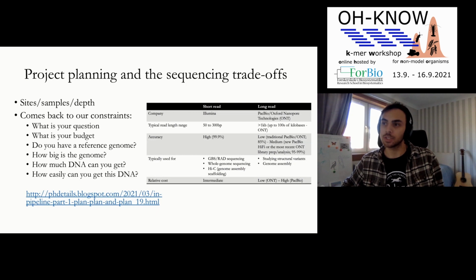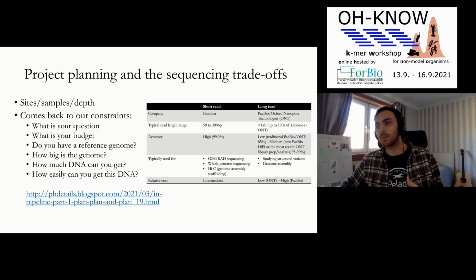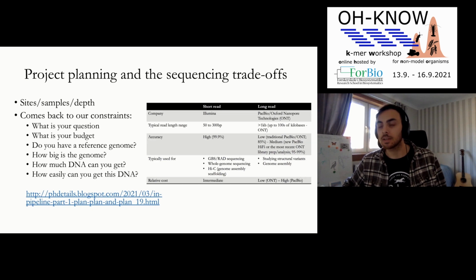So it's important to identify your question, think about your budget, which may be you or your boss's responsibility. You can even think about things like, do you have a reference genome? Does it make sense to be sequencing hundreds and hundreds of whole genomes if you don't have a reference? It might make sense to think about how big your genome is. Obviously, the output of these machines is constrained by basically the number of bases you want to sequence. So if you work on a 100 gigabase genome, you are going to get much less population level sampling for the same amount of money than if you work on something with a very small genome.